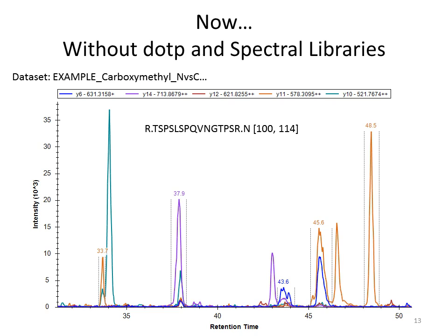So here are cases. In this example data file, this was something that we had done where a customer came to us and said, and everything's been anonymized, I hope, but they didn't buy an instrument anyway, and we're not trying to do anything with their data other than illustrate to you. They had a list of proteins. They said, we want to detect these proteins on a triple quad.